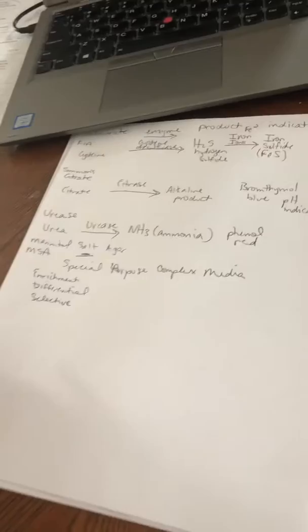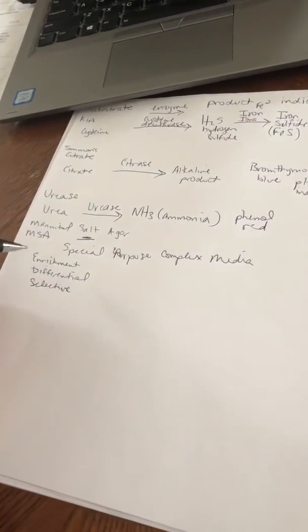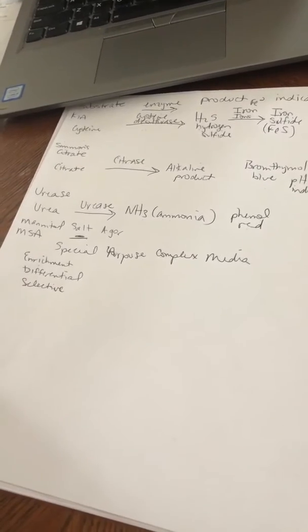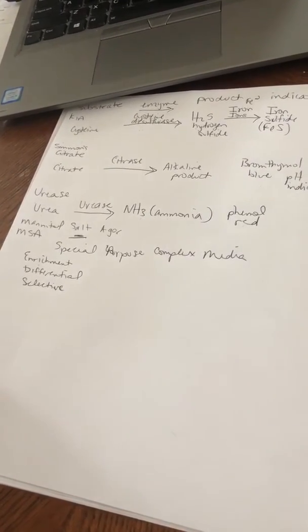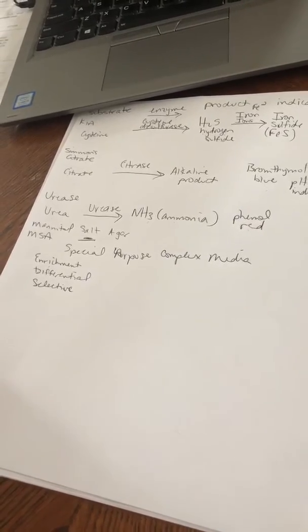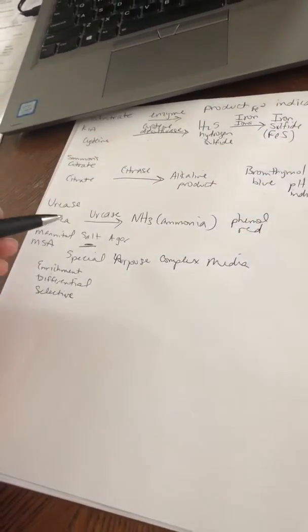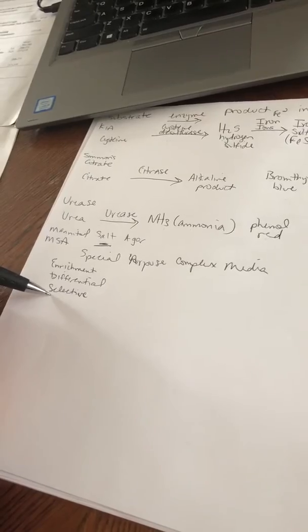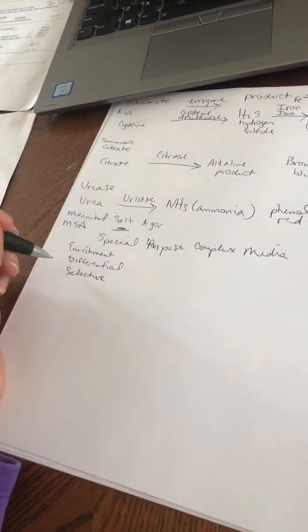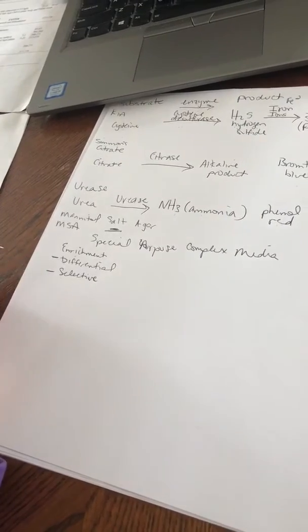in real life. And I really wish you could have seen it in real life. So we would have done this with our unknowns, and then we would also have done a skin swab to see what kind of bacteria we could pick up from our skin and if it would change it a different color. But anyway, there's 3 different kinds of special purpose complex media. Mannitol salt agar happens to be 2 of these. It's both differential and selective.